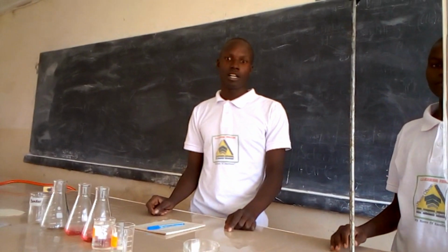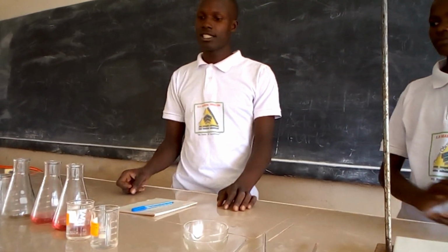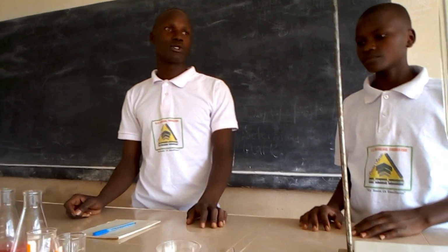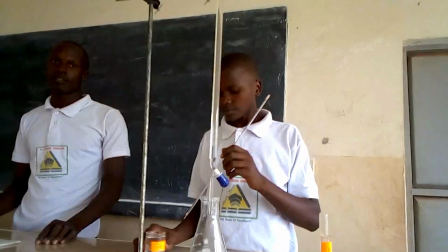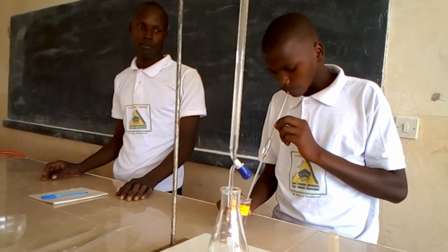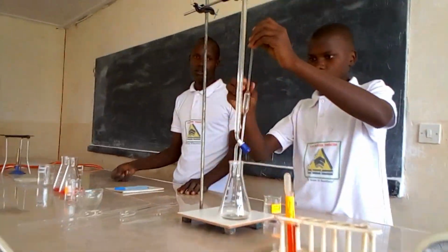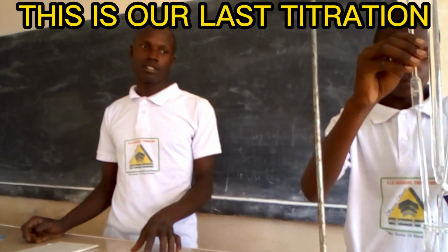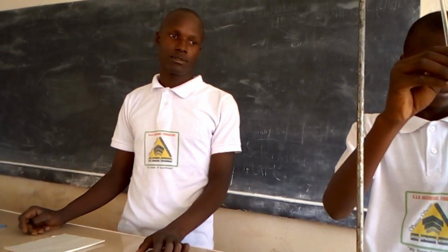We shall now repeat the steps without adding the indicator, which is the methyl orange. So, as you see, the burette has already been filled again. He will measure the sodium hydroxide in the pipette as shown. This is our last titration in the experiment, and we shall add 33.4 as we saw in the first and second steps.